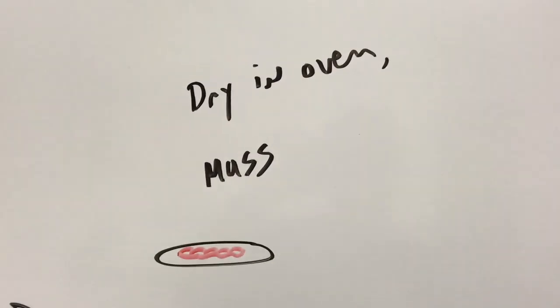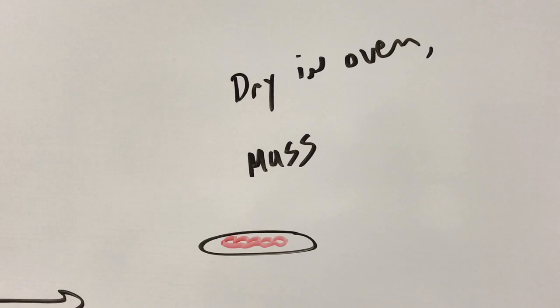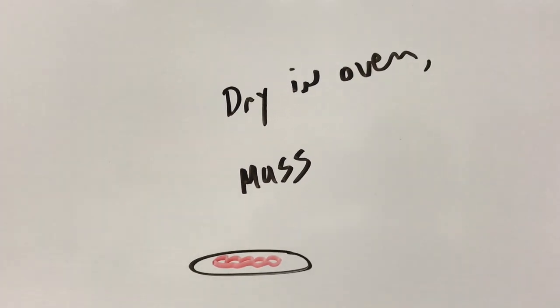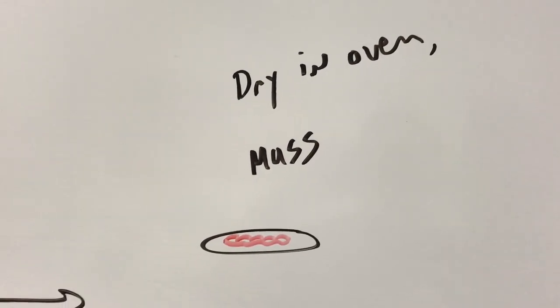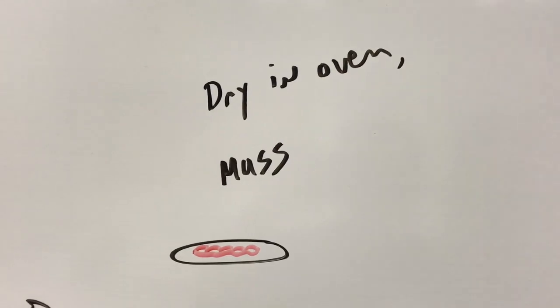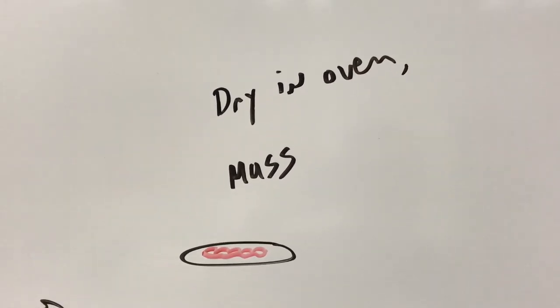Once we've scraped off all of the solid copper onto the filter paper, we're going to go ahead and place this in the oven to dry. It's going to take a couple of hours, and then when we take it out, we're going to mass this one last time. I should have mentioned before that the filter paper you use, you would have pre-weighed it so that you know exactly how much the filter paper weighs. So through this process, we should be able to collect all of the mass values that we need to carry out the calculation.